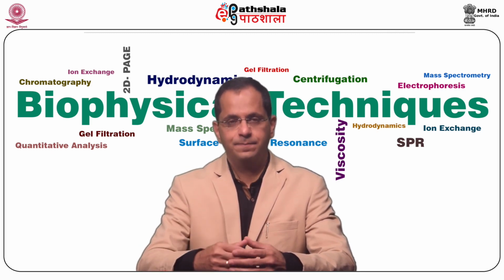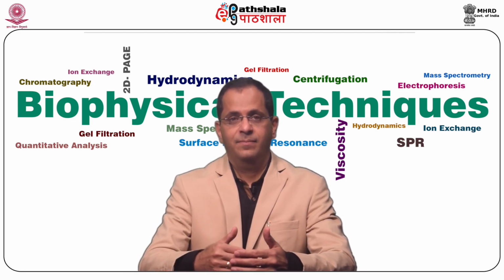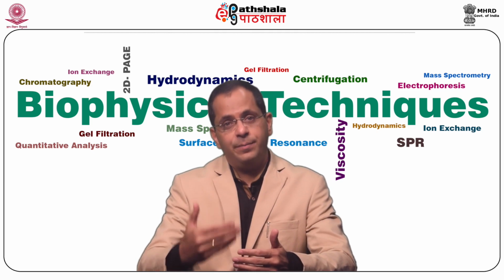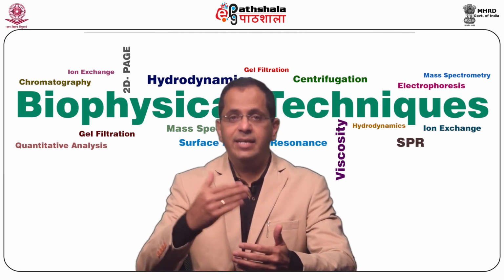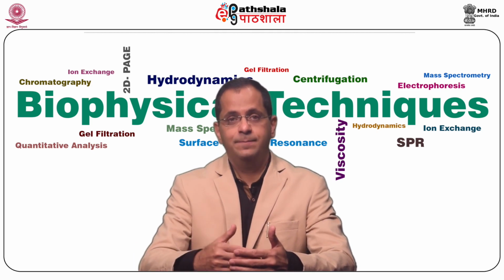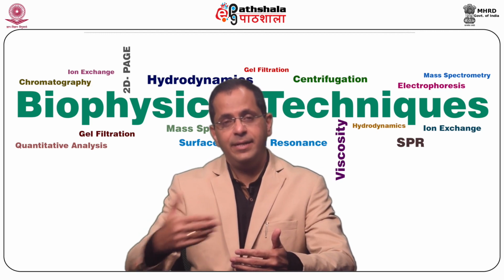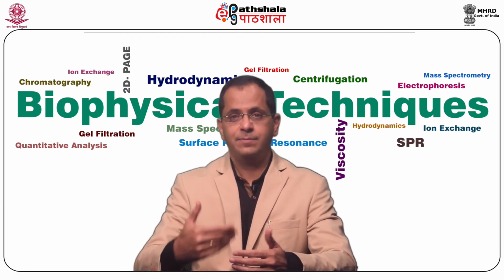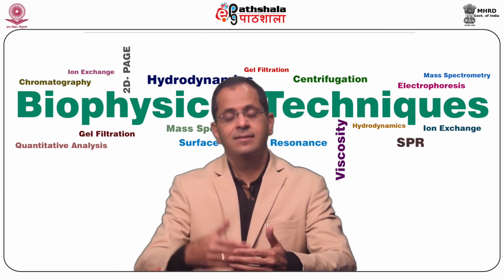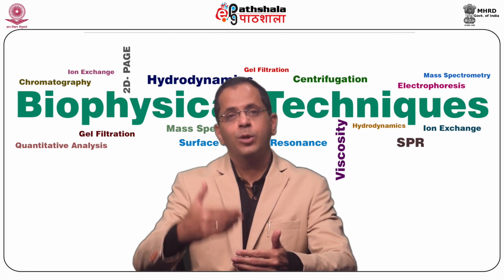First, the advantages. It has higher sensitivity. It has easier automation of the procedures that are involved. It has better reproducibility. It has reduced influence of intrinsic protein parameters. There is availability of sophisticated mass spectrometry machines these days. Quantitative data is statistically more robust.